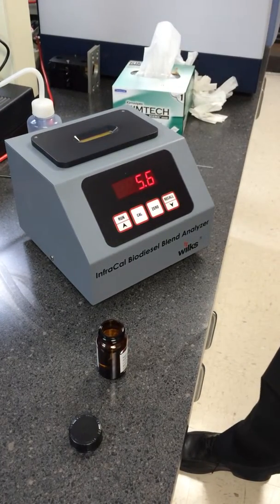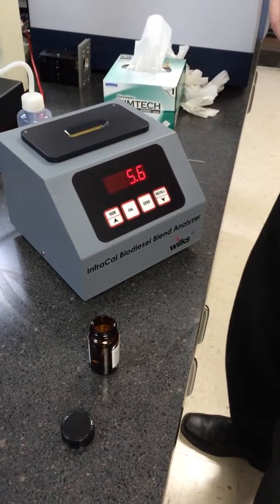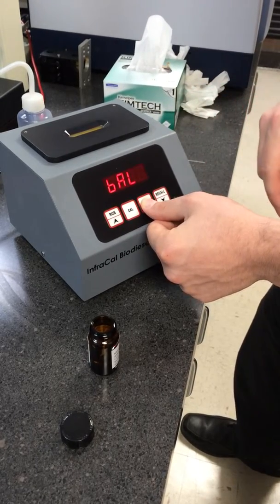Allow 15 seconds for any residual solvent to evaporate. Then you'll want to hold down the zero button until you see BAL on the screen.